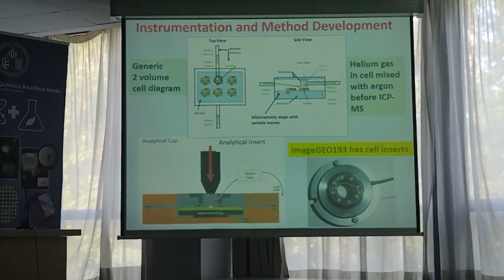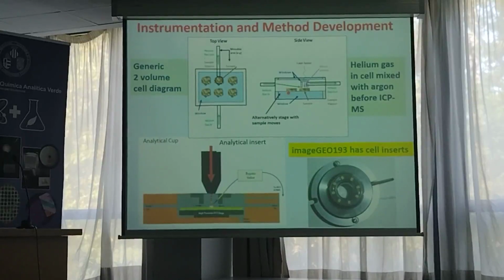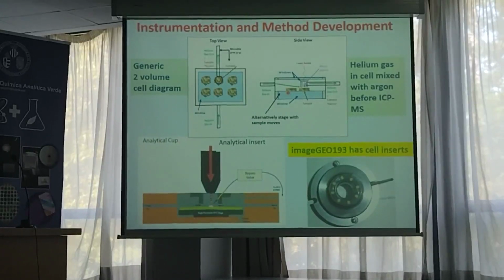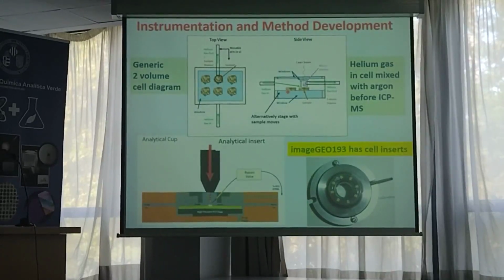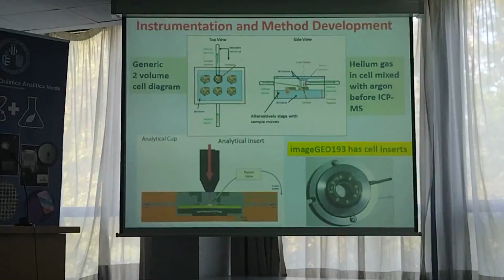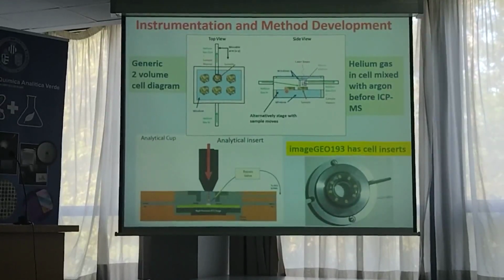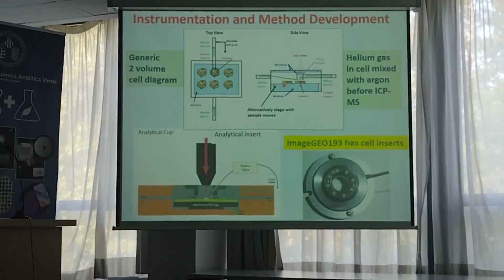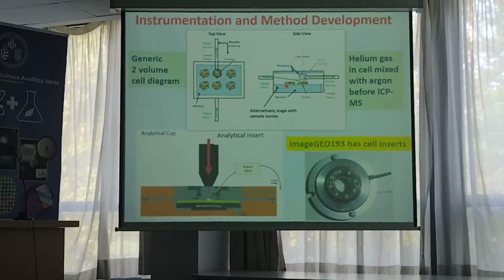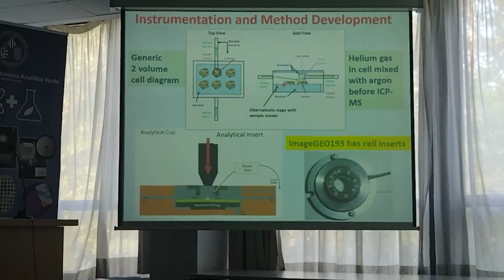Normally we use helium gas for this because the very small particles are maintained in the gas stream better in helium than they are in other gases. But previously people would use argon, and unfortunately now the price of helium has got incredibly expensive, and I actually see the day, maybe in a year or so's time, particularly with the problems in Ukraine, where we all might not be able to have helium gas, and we might be going back to using argon again.